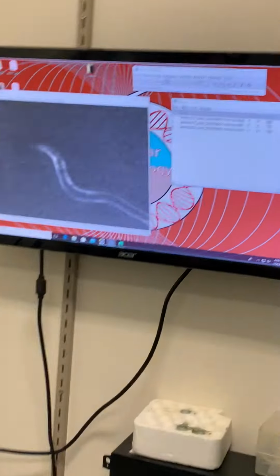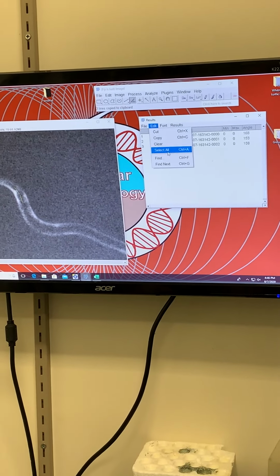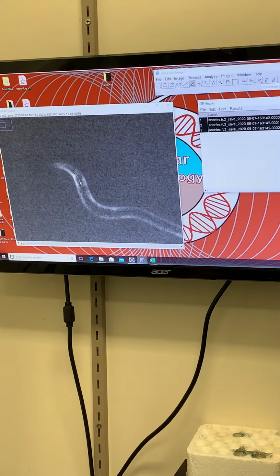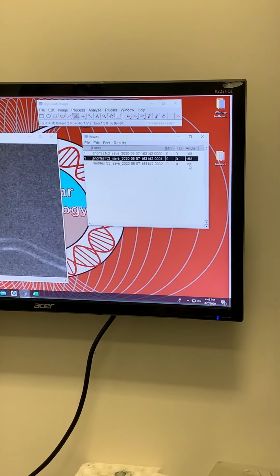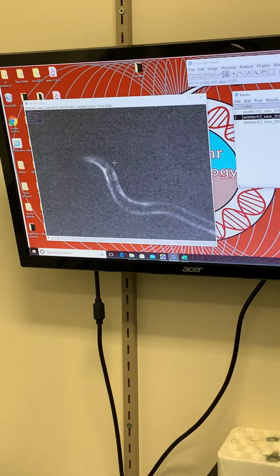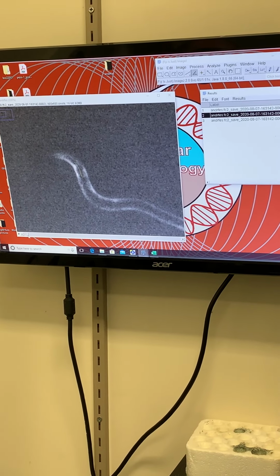And so we get these measurements, and once you go through the movie, again, this is the super important part. They are equidistant, halfway between the top and the bottom. And one thing that I gotta tell you is that the angle that you get is always an angle between 0 and 180, which means that when this worm bends, right now it's bending this way, so you get an angle that is 150, smaller than 180.